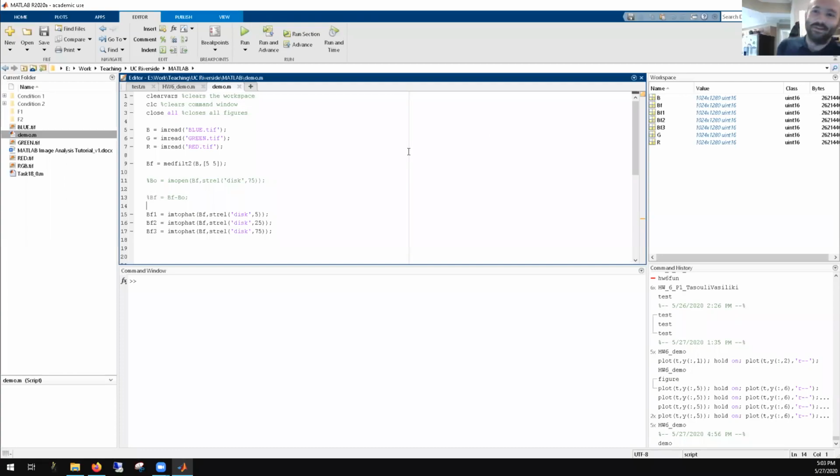There we go. So what we talked about last time is median filtering and Tophat filtering, and in the future, I want to circle back around and start doing some more advanced stuff with filtering. There's a lot of better filters you can use in very specific situations. One really important one is the Kuwahara filter, which is a nonlinear median filter, and I can show you how to develop that and utilize that.